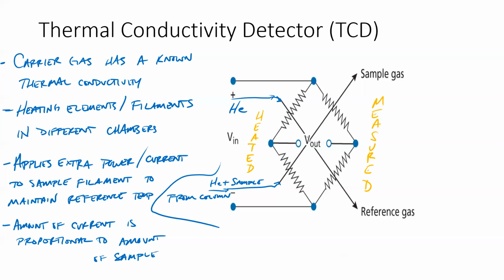We did not talk about atomic emission, but it's sort of the reverse of AA. That's chapter 9 if you want to go back and look at it. But it's using light to sort of figure out and detect when there's something other than mobile phase in the stream.